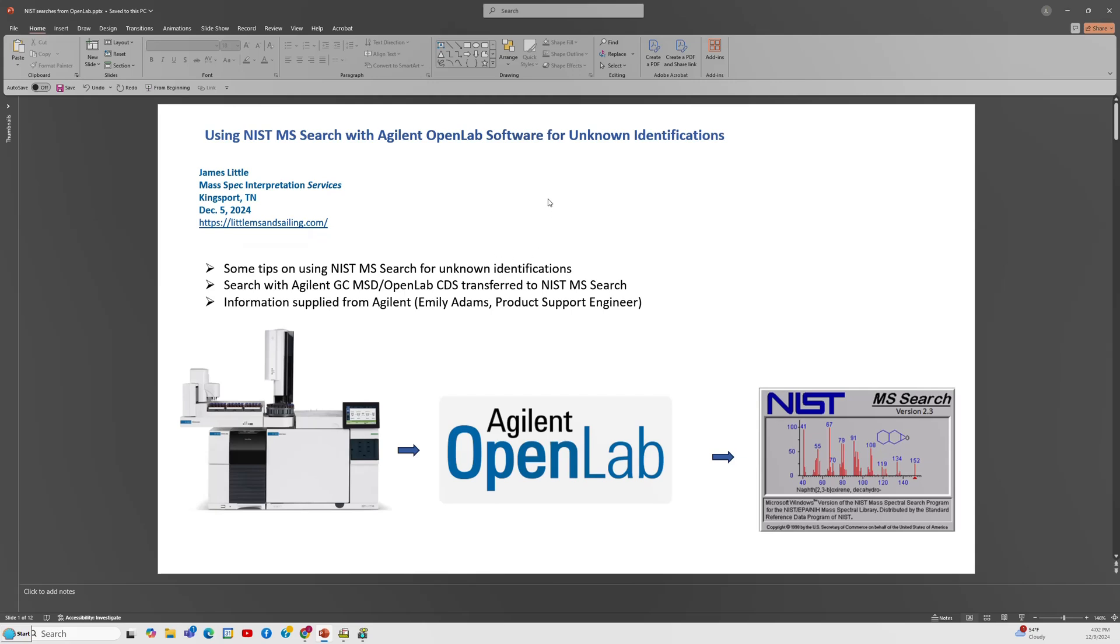I've got some of the tips that I've put in this video. You search with the Agilent GC MSD, that's where we acquire the data. It goes to OpenLab and it's transferred to the NIST for the MS search and identification of unknowns. The information supplied, at least the majority of it supplied, was from Agilent, from Emily Adams, a product support engineer.